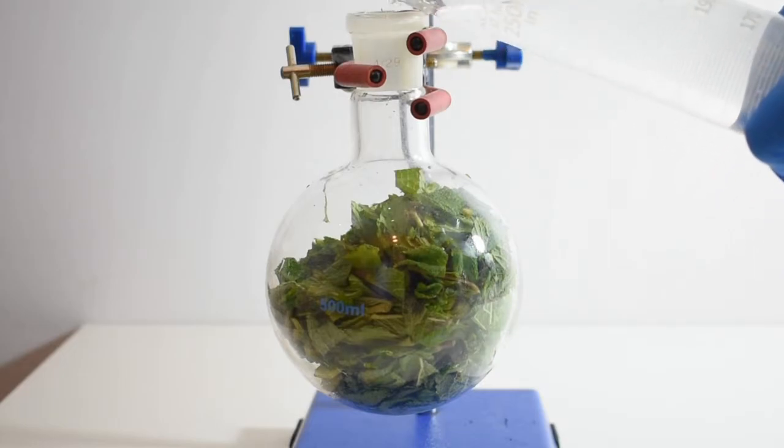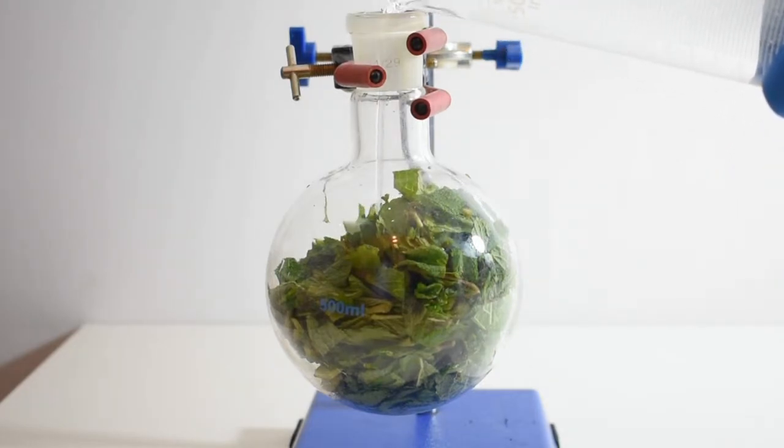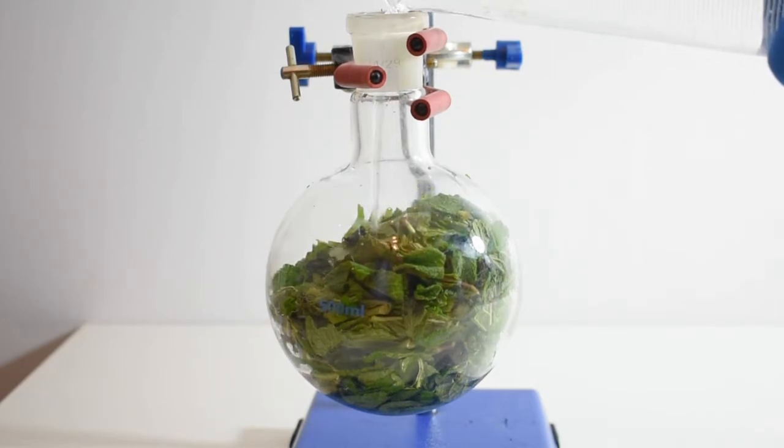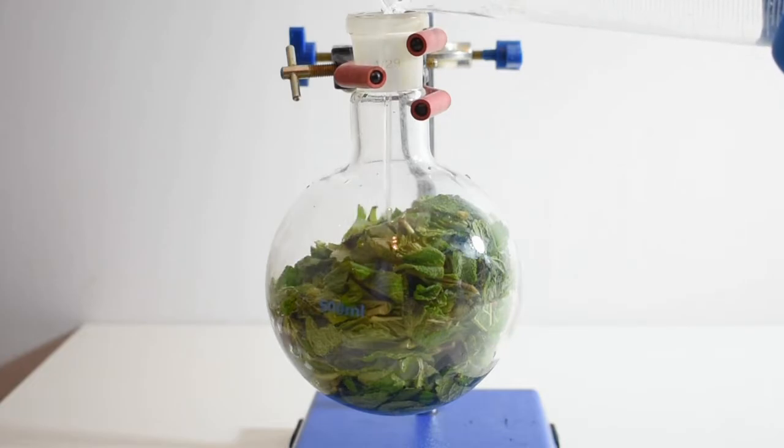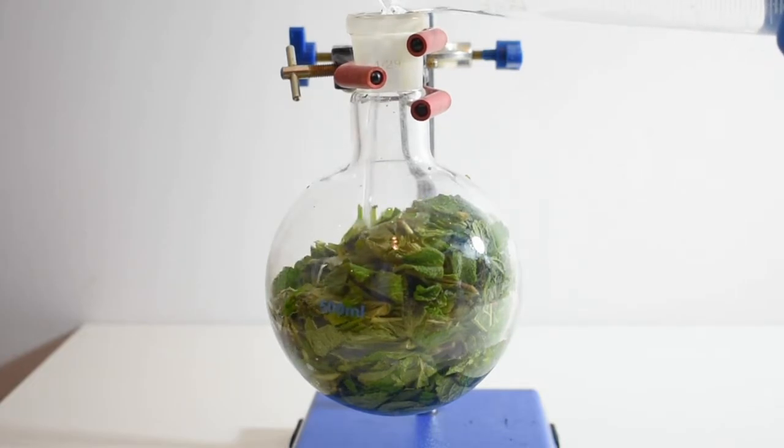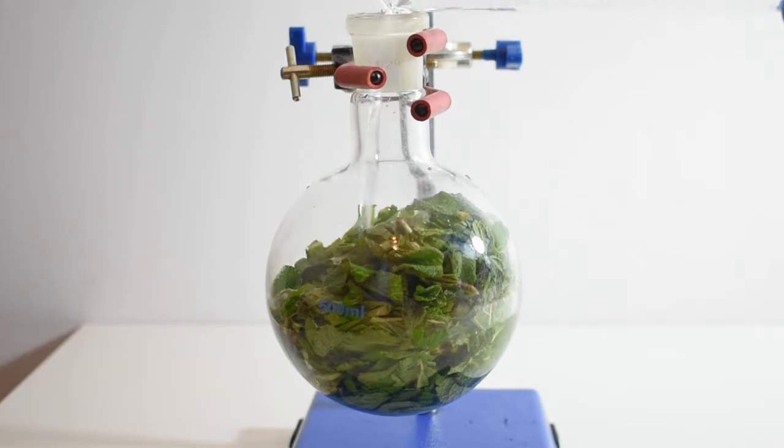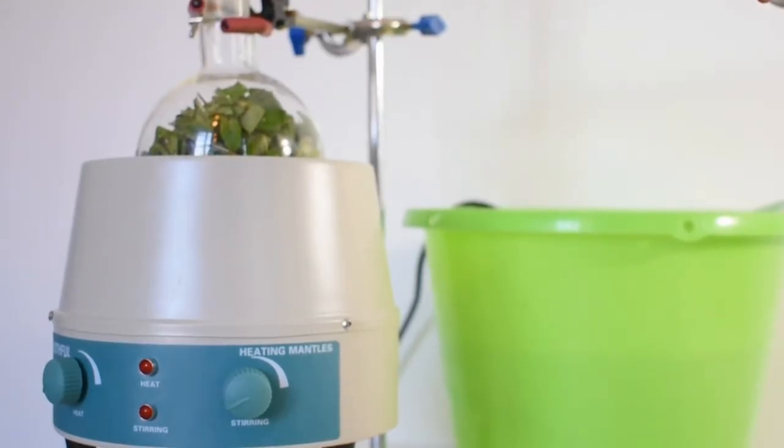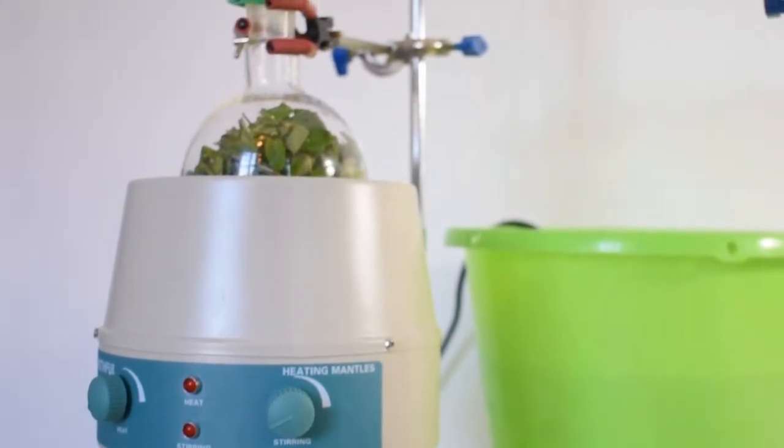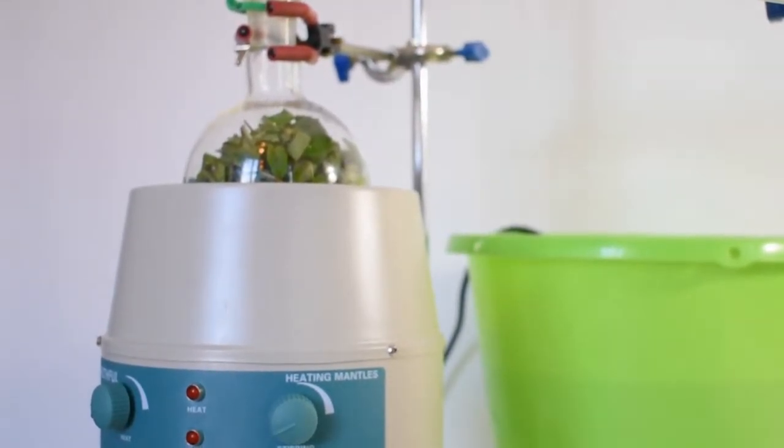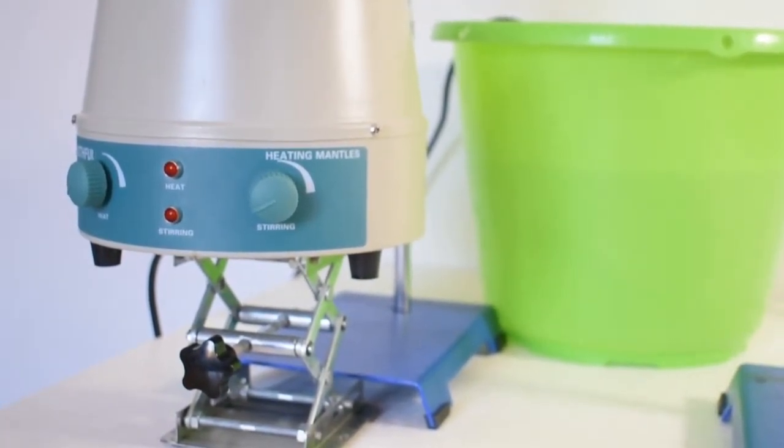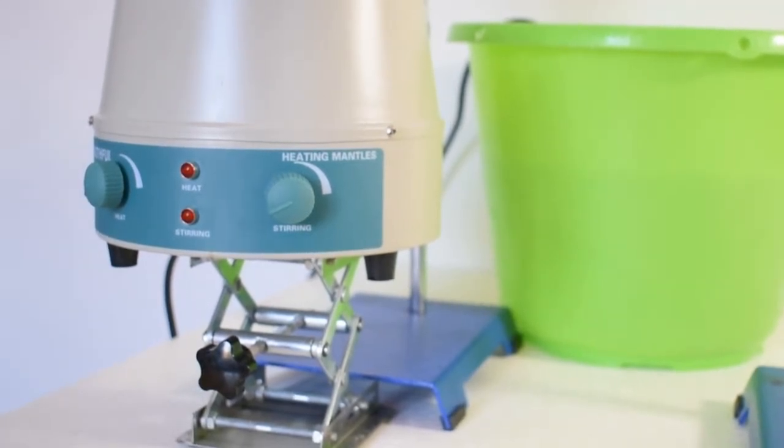About 250ml of water is added to the flask as well. This water will act as the carrier for the oils in the steam distillation. The flask with the mint and water is sitting in a heating mantle. The heating mantle is on this jack so it can be lowered to reduce heating in case of the flask boiling over.